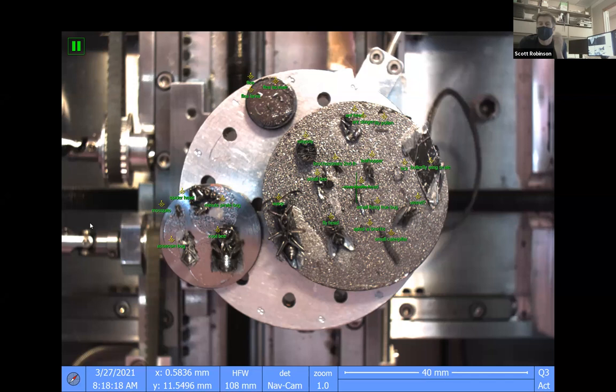So I should say also that entomologists are the best people to talk about insects, and arthropods. Those of us who are just electron microscopists, we've learned a lot about insects over the last 20 years, but we're nowhere near as good as entomologists. And so what we've been able to do is offer free time on the electron microscope to entomologists if they will help us answer questions on Bugscope. And that is a really big thrill, because entomology is so cool. It's just like we're looking at an alien kind of life, and it's really super, super interesting.